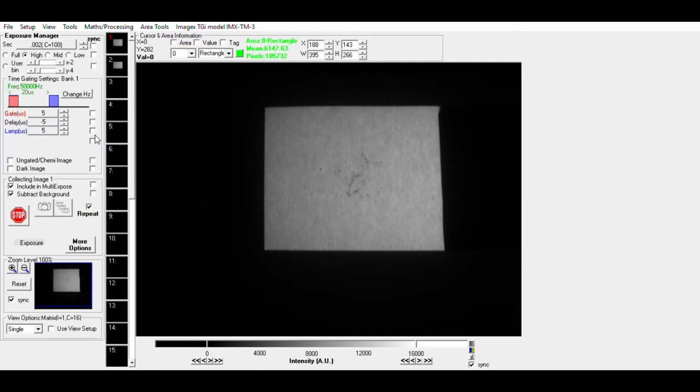For this demonstration we have a small sample of photocopier paper. It's been dyed with an optical brightener by the manufacturers to make it look nice and white under normal lighting. Because of this, it glows with broad spectrum fluorescence under ultraviolet light. This also happens to be short lifetime, of the order of a few nanoseconds, which makes it quite useful for this type of demonstration.